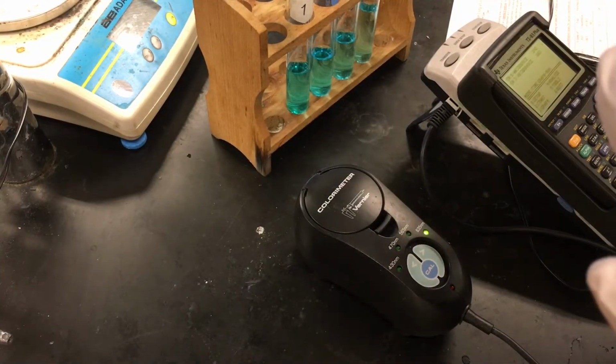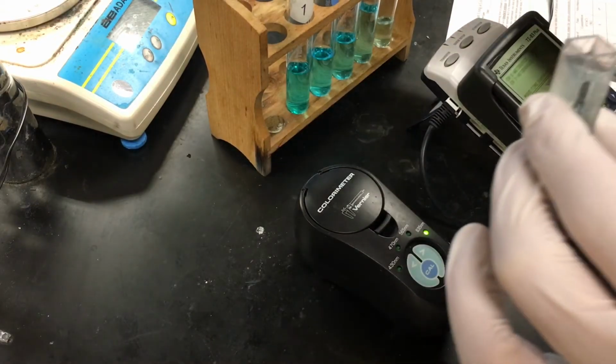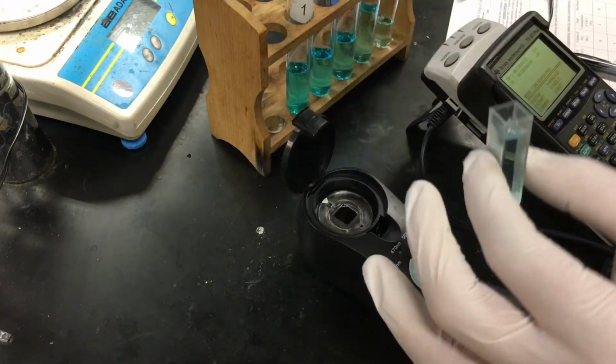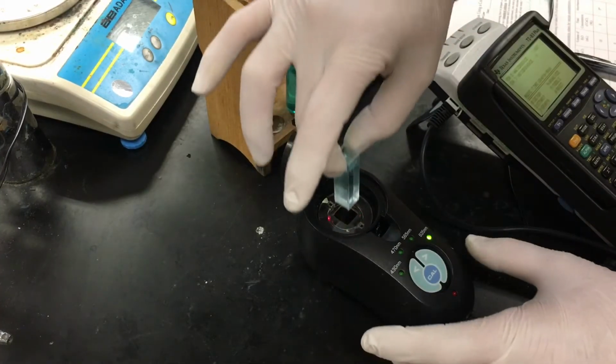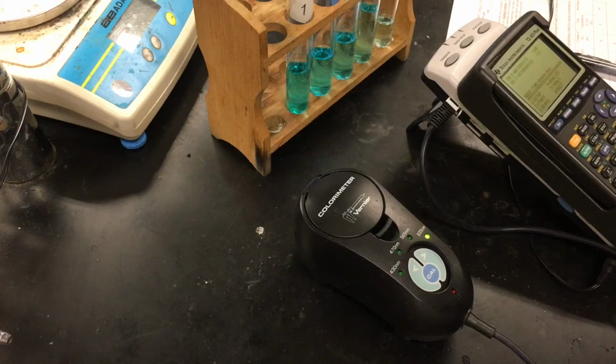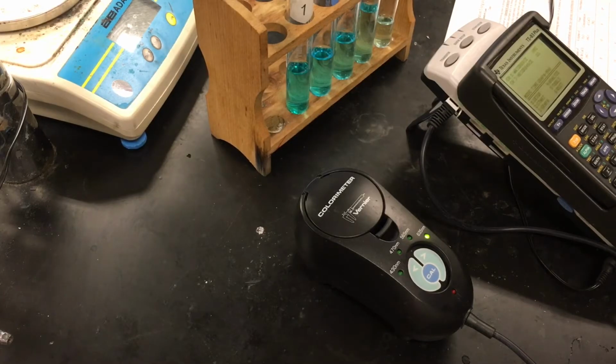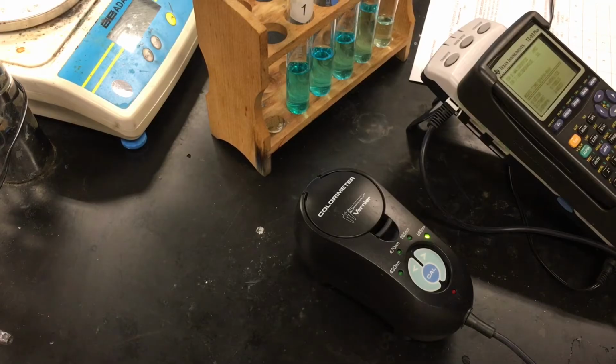And then we're going to measure the absorbance of that. So we're going to make sure that the clear sides of the cuvette are lined up with the path of the light. Close the lid and look at the absorbance value, 0.092. And so this is the absorbance for test tube number 5.